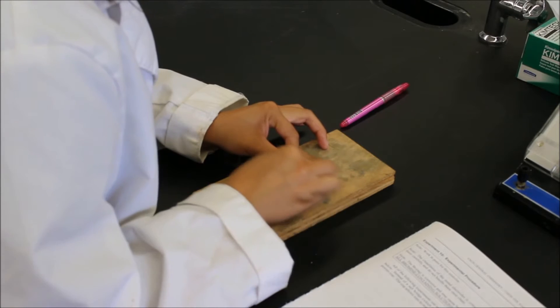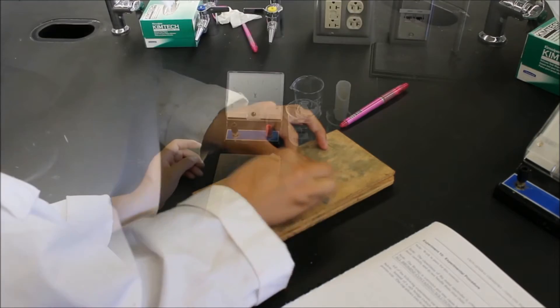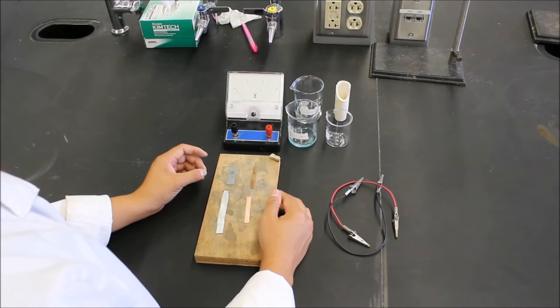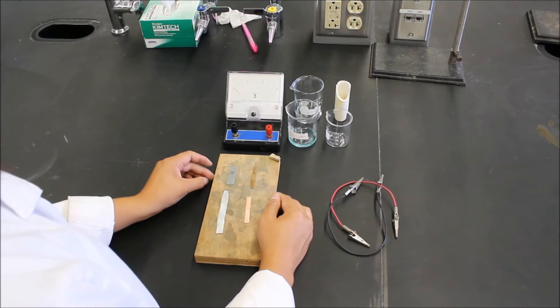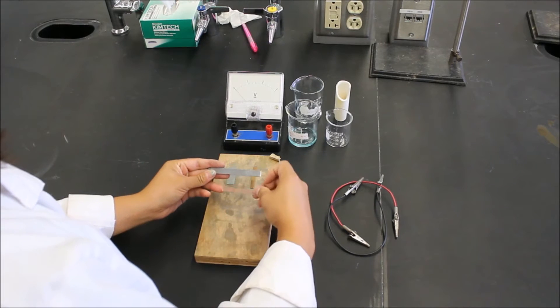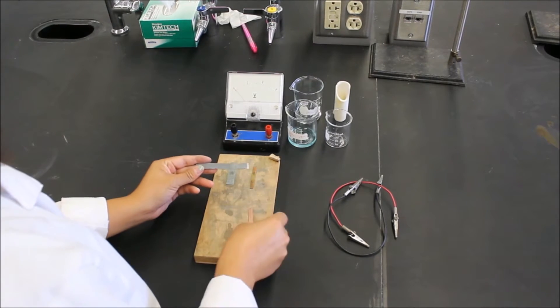But first off, we have to polish the electrodes. When you're polishing the electrodes, make sure that you don't spend too much time polishing these. You want them to look nice and shiny, like these polished electrodes from their original state.